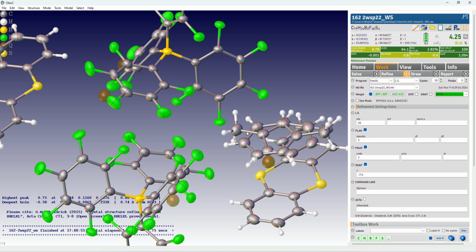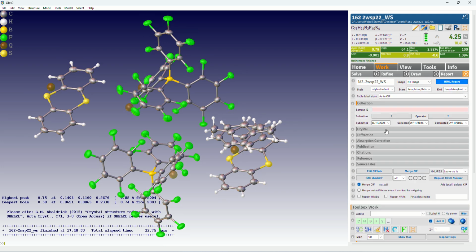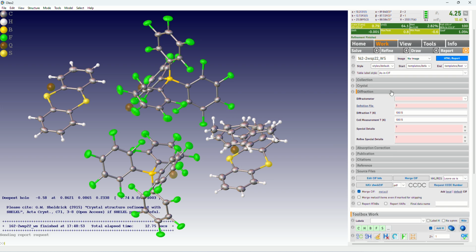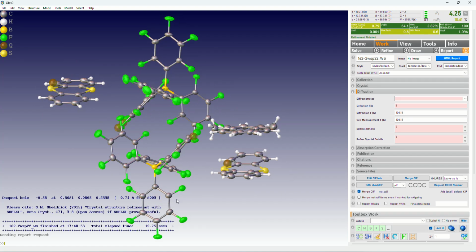We can also, just to be sure, look at the bond lengths a little bit. Yeah, 1.49, 1.5. What about the benzene rings? 1.37, 1.37, 1.41, yeah. Okay, and we can do the report. Again, we didn't input anything, so we'll get some alerts during CheckCIF. Let's see what other alerts exist, apart from those related to the lack of information in the CIF file. We wait a little bit.